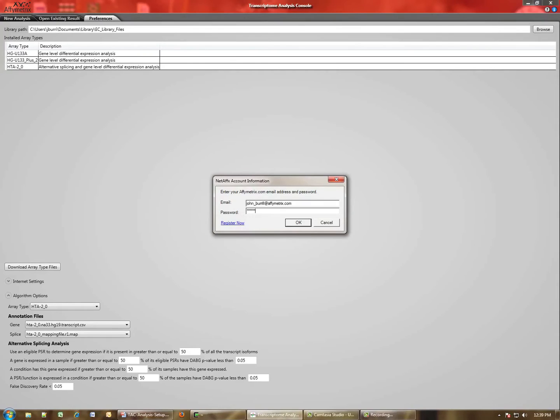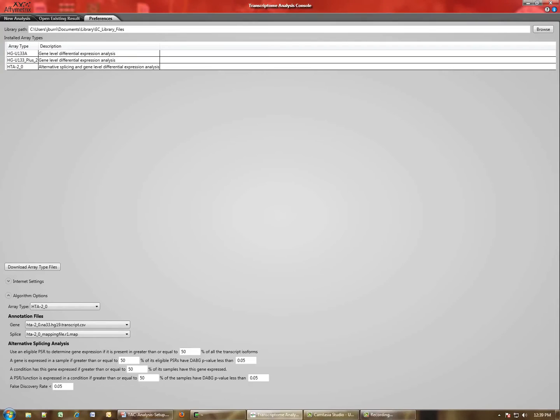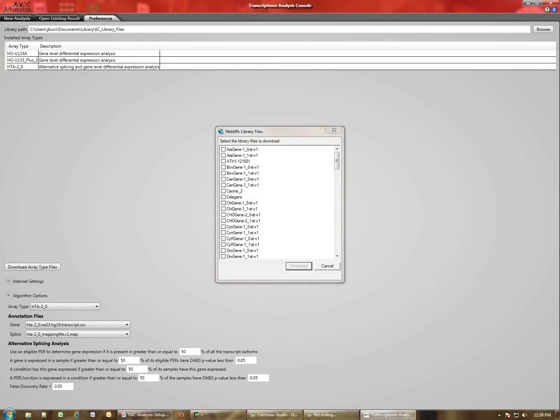If you do not have an account, you can click the Register Now button to sign up for one. After this is done, you'll see here in a second there's a pop-up that lists all of the expression arrays that are supported in TAC.